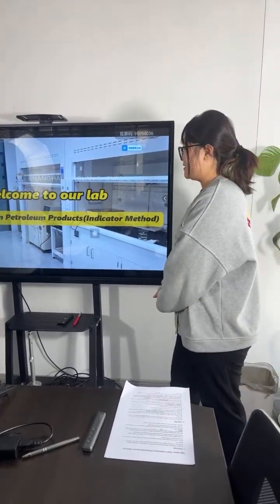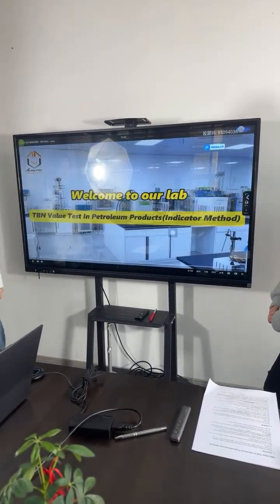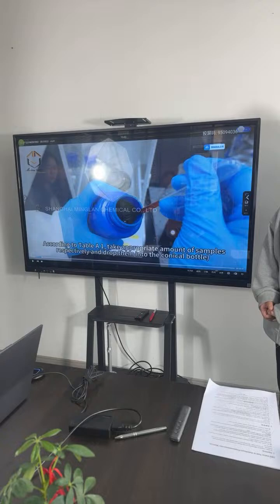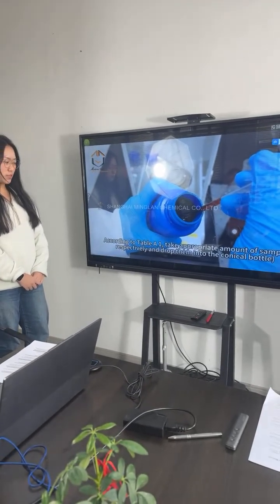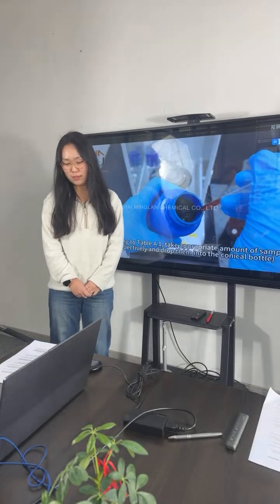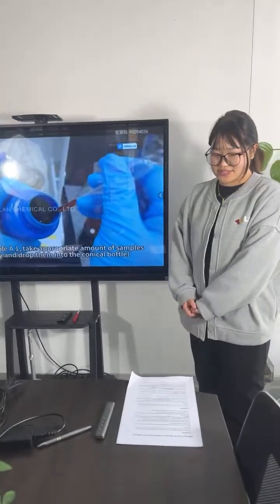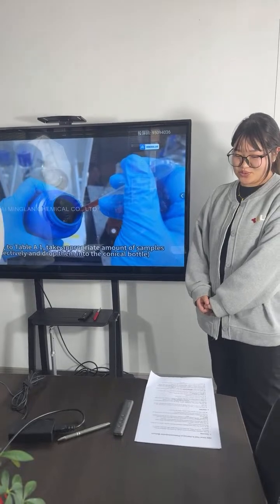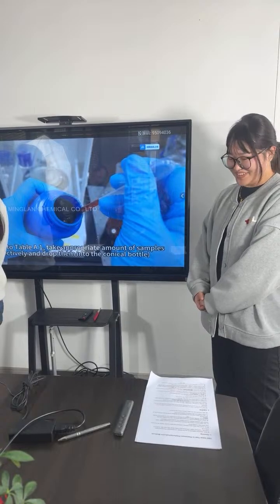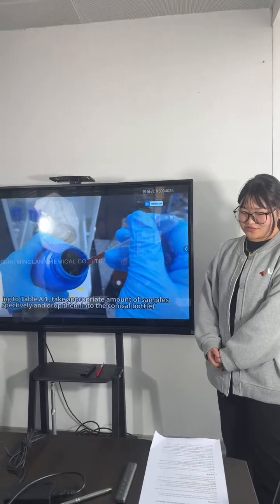Hannah, what's the first part? Okay, let me show you. According to table A1, take an appropriate amount of samples respectively and drop them into the bottle. Do you know what additive samples are used for the test, Winnie? We use T207 mu, T21001 mu, T21002 mu, T20118, 8556. We need to record the weight of each sample.